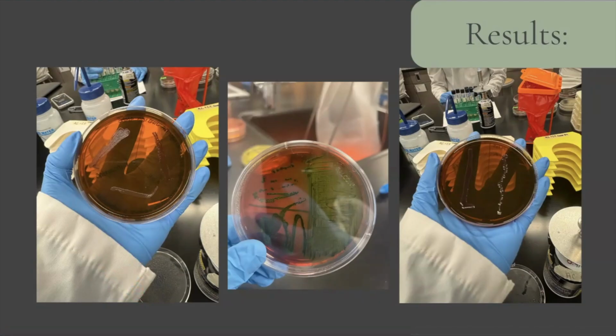The S. typhimurium growth was clear, so it's a non-lactose fermenter. And for our unknowns, 114 was dark purple, meaning it's a lactose fermenter, and same for unknown 294. A dark purplish growth means it's a lactose fermenter.